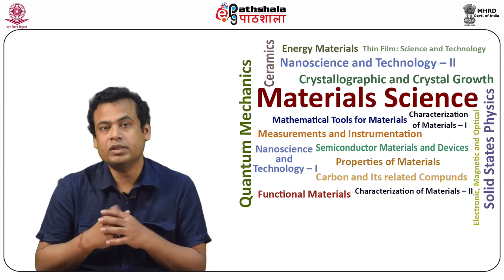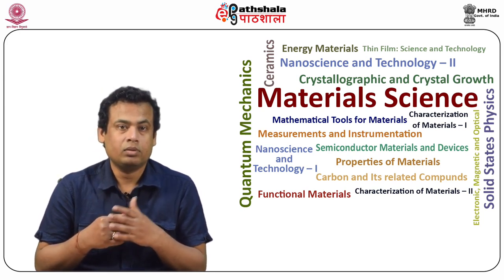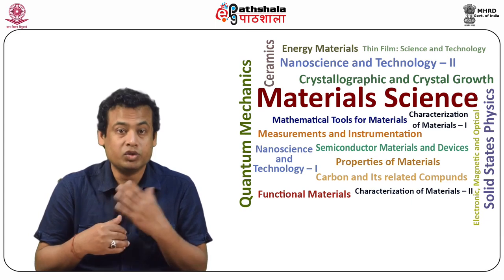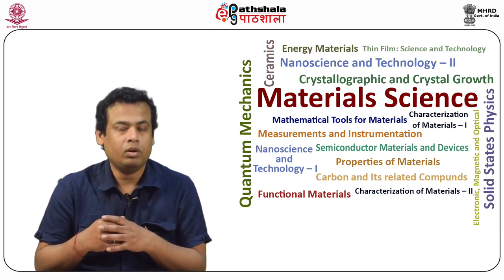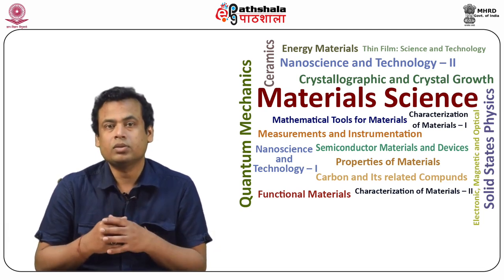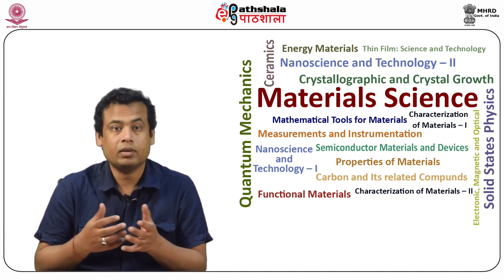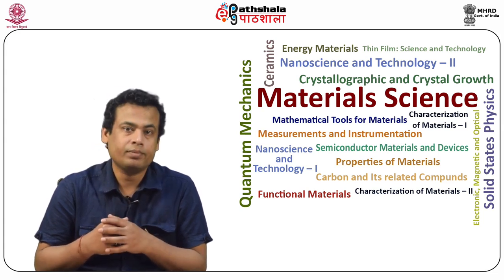The morphology studies the shape, texture, and the distribution of materials at a surface and is best evaluated using imaging techniques such as optical microscopy or electron microscopy. These methods can also provide layer thickness using an optical profilometer or by taking an image of a transverse section of the specimen.